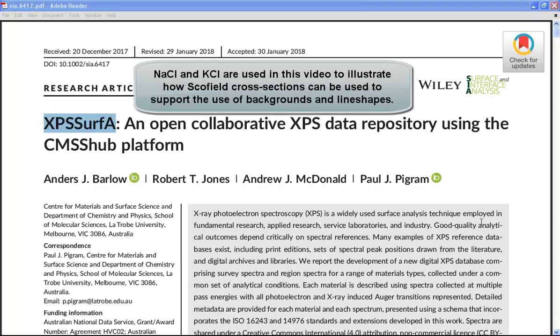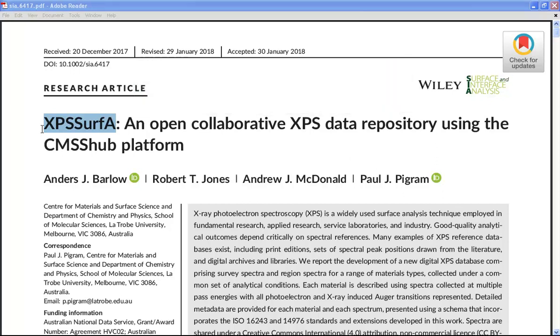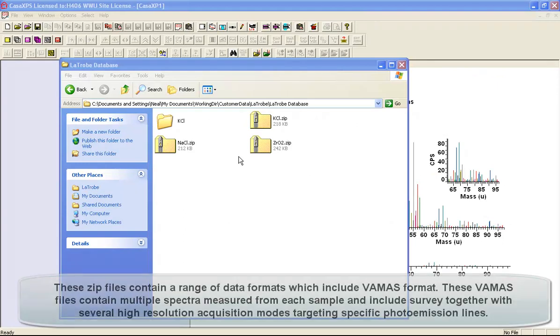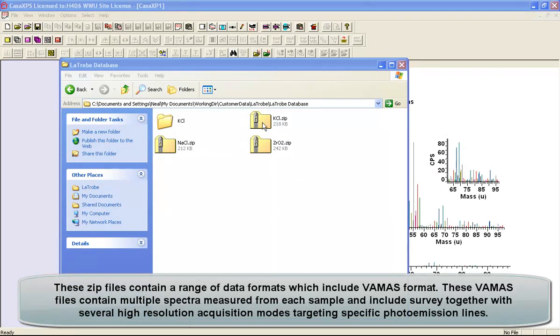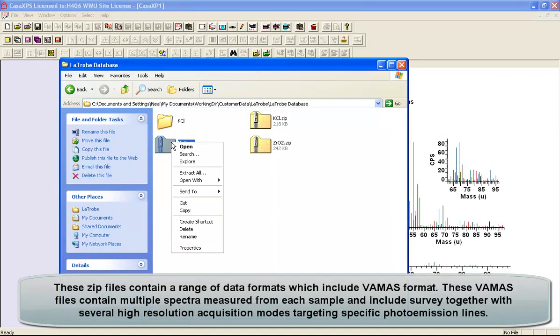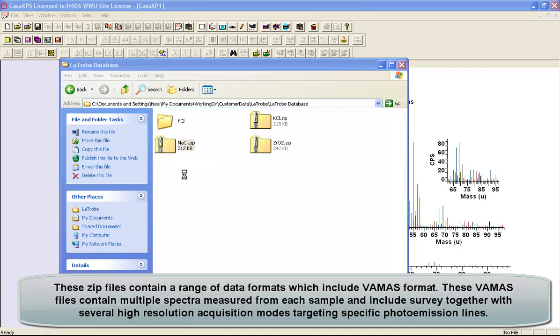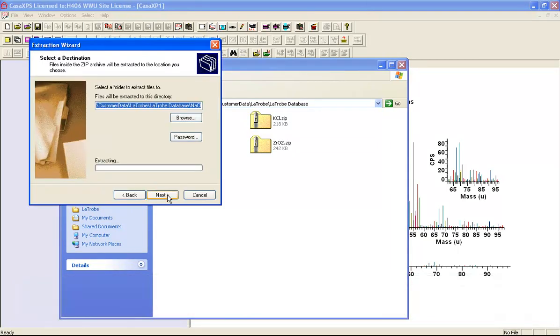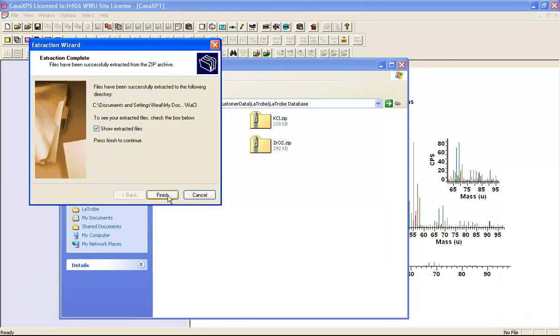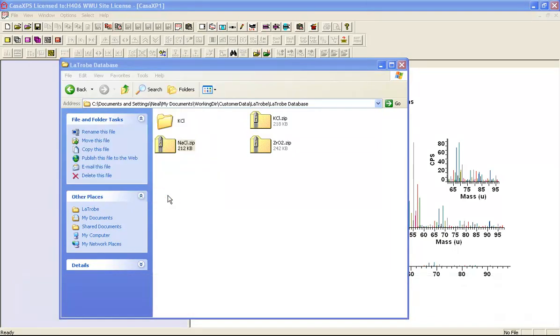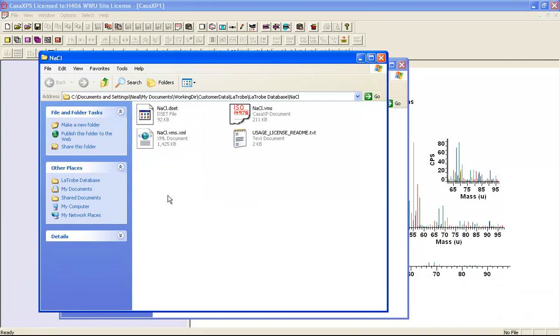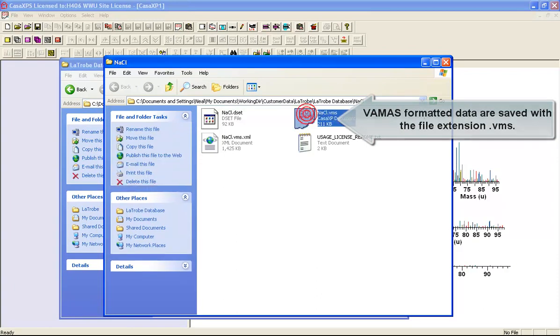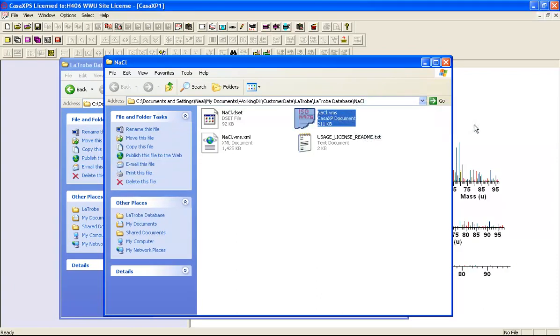Data in this video have been downloaded from the web from a database that has been prepared by La Trobe University in Melbourne, Australia. When downloaded from the web, the database provides zip files and you can simply unzip these files. Within the zip directory there's a VMS file which you can just drag and drop into CasXPS.